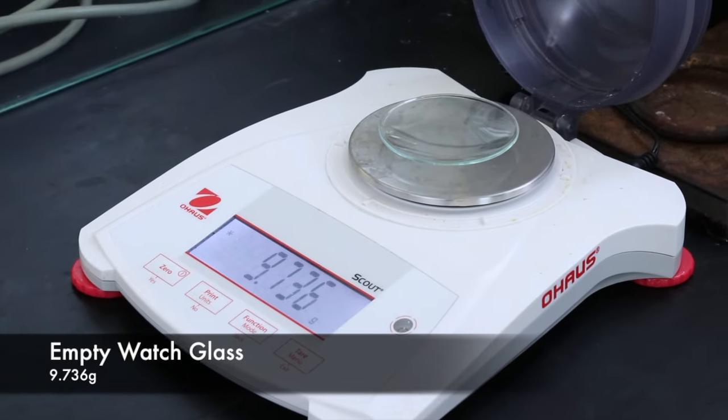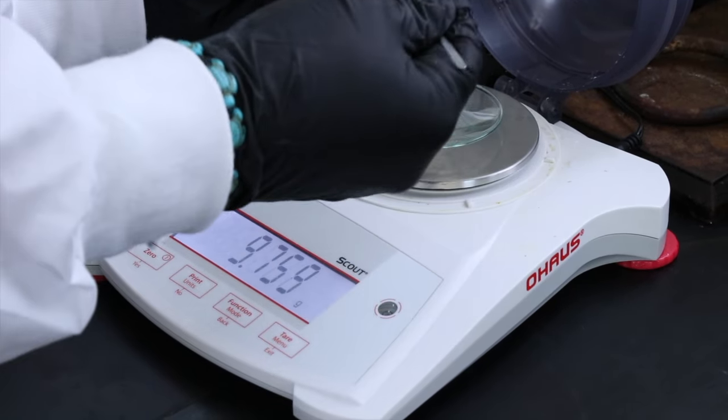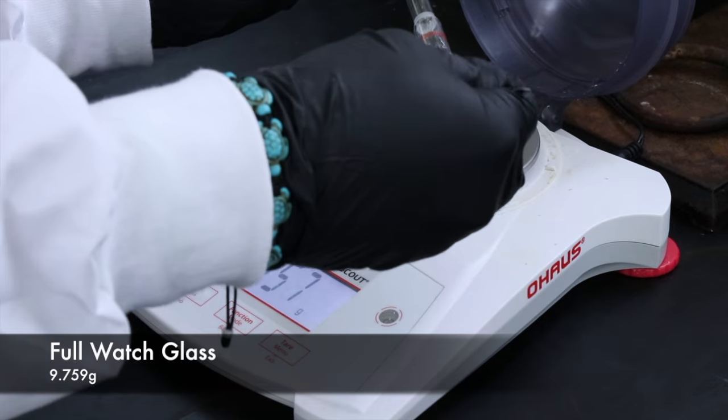First, I'll want to weigh out the alcohol product on a watch glass so that we can calculate a % yield for this experiment.